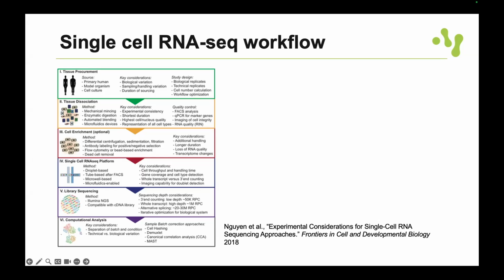Then you need deep sequencing, or if you do immune profiling, you might need to do deep sequencing depending on the method. Or maybe you just want to see which cell types, and then maybe you don't need such deep sequencing. Once you have sequenced, you do the computational analysis, and that's what we talk about mainly in this course, and there is also support at NBIS if needed.